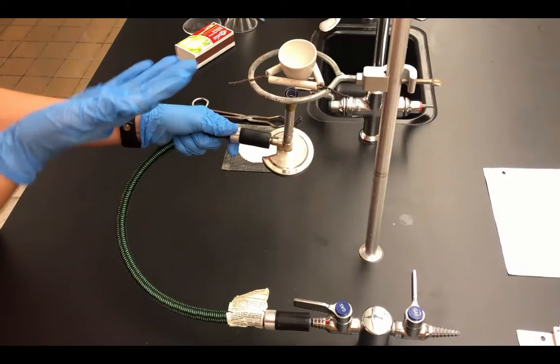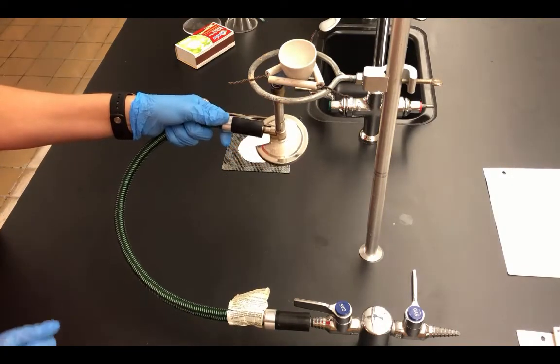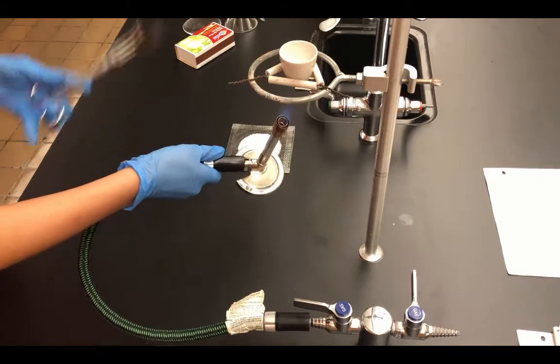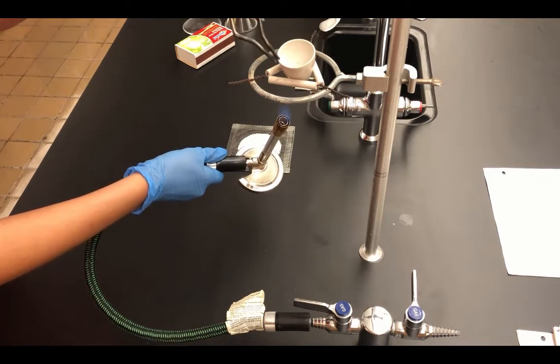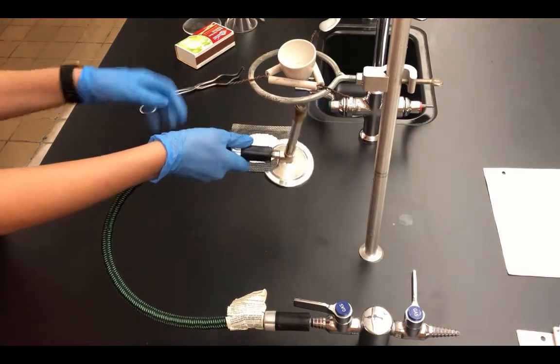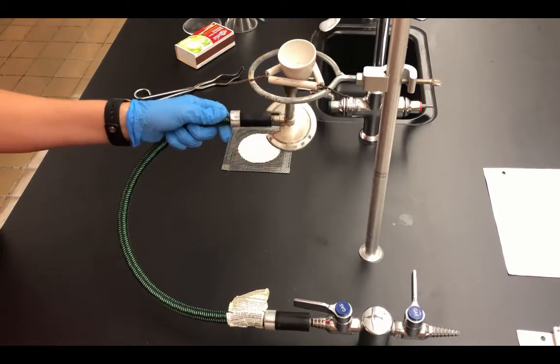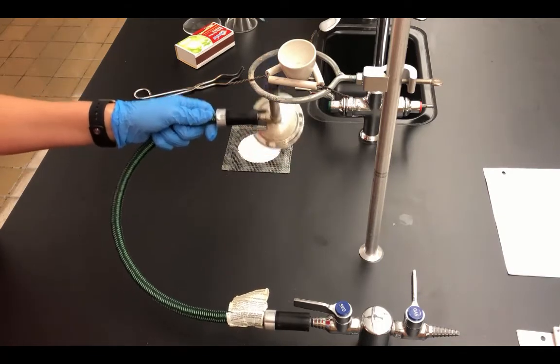What's happening is any water that is in the substance will escape into the surrounding air. And these substances are hygroscopic, which means they absorb water from the air. Because they're hygroscopic, we want to heat the substance in the crucible to remove any water. So I'm going to go ahead and fan this for 2 to 3 minutes, and then we'll find the mass again.